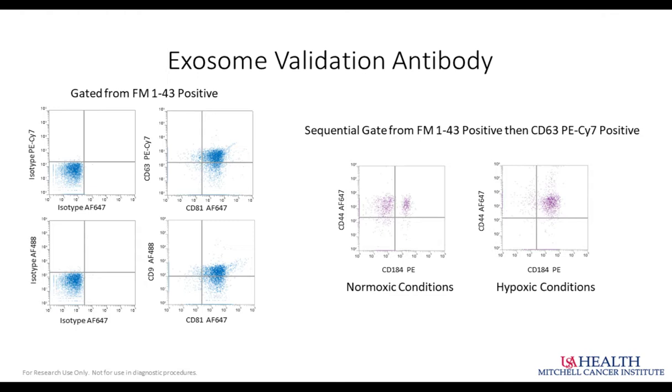Probably about 60% have crossed that threshold. Again, every prep can show high variability in how much of each of those markers are there. Sometimes you don't have any on one of them. You might only have, say, 9 and 81. And we do all 3 because we need to assess what that particular preparation has on its surface.